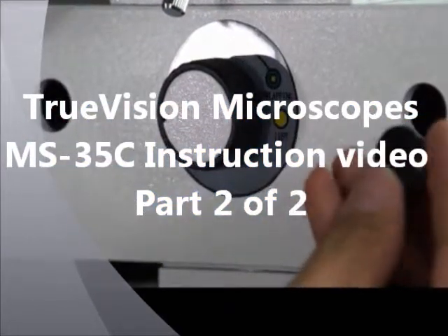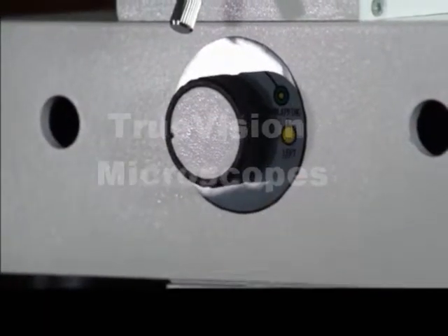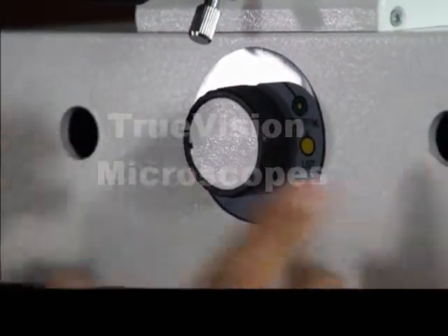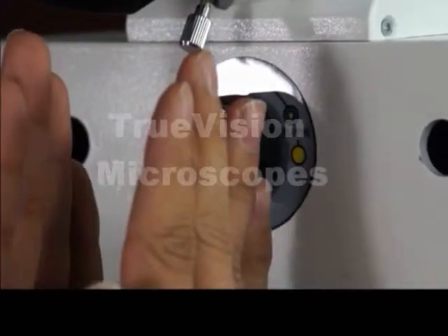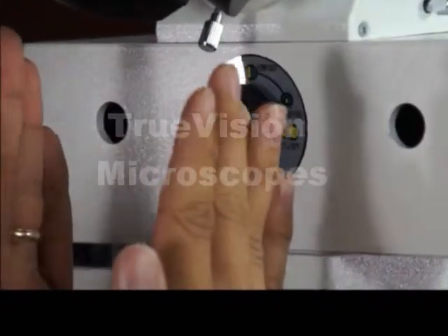These are just dust caps. Inside, we have screws. These screws are for adjusting the separation line. One of them adjusts the width of the separation line. If the separation line is too wide, it makes it narrow, or it can make it wider.